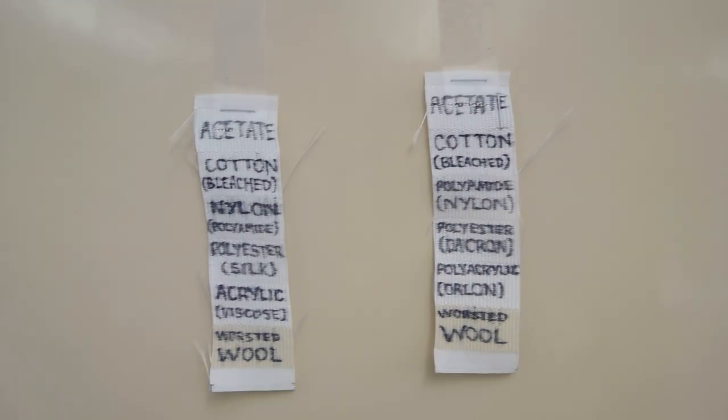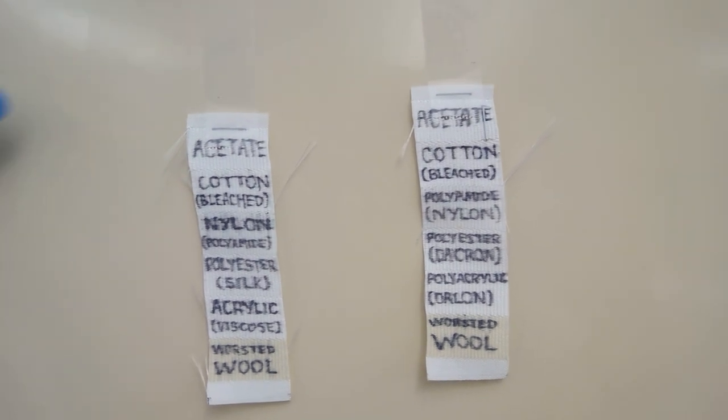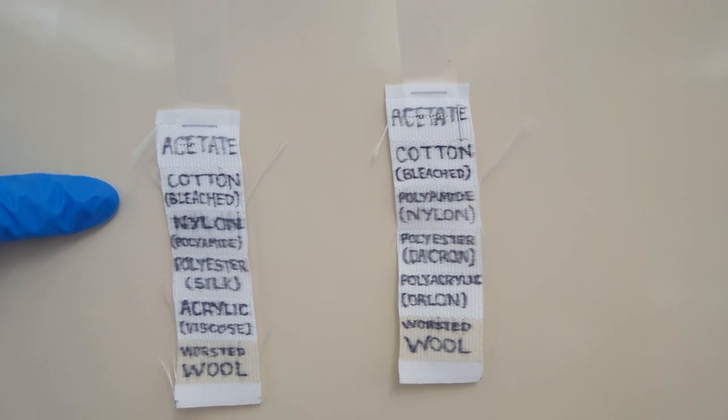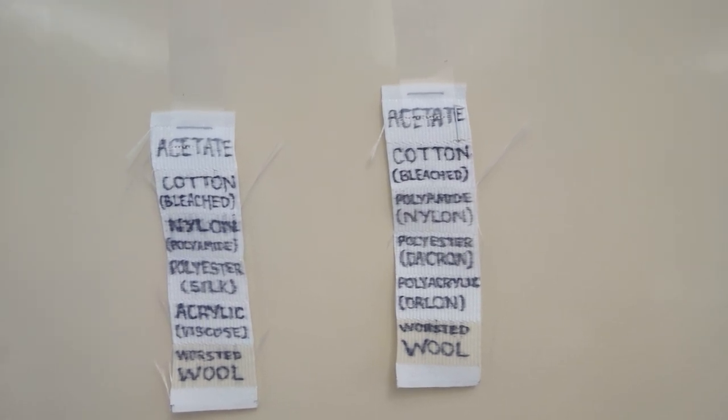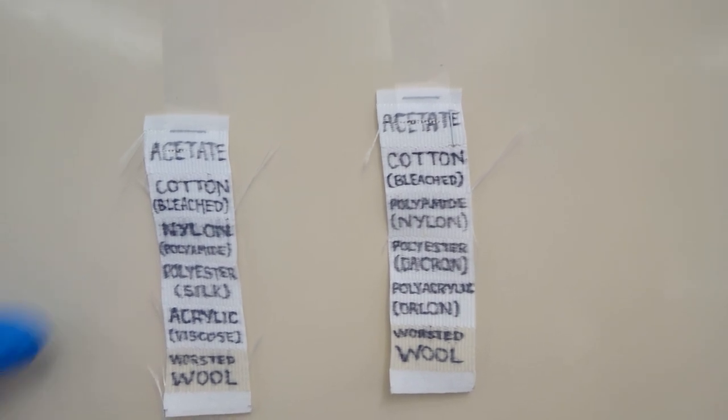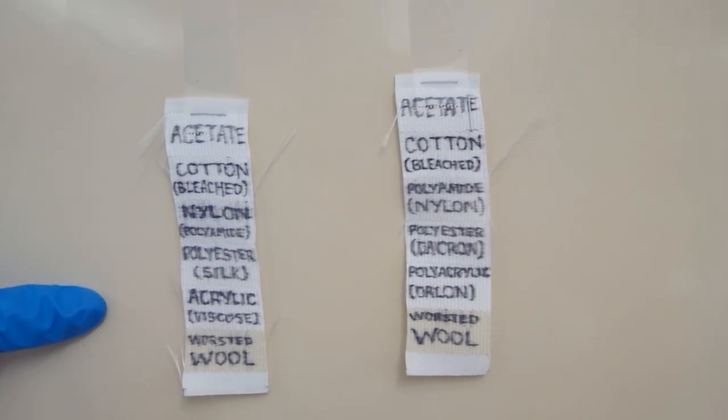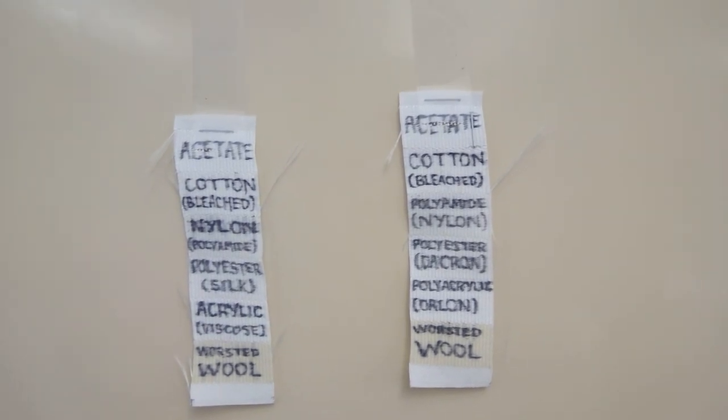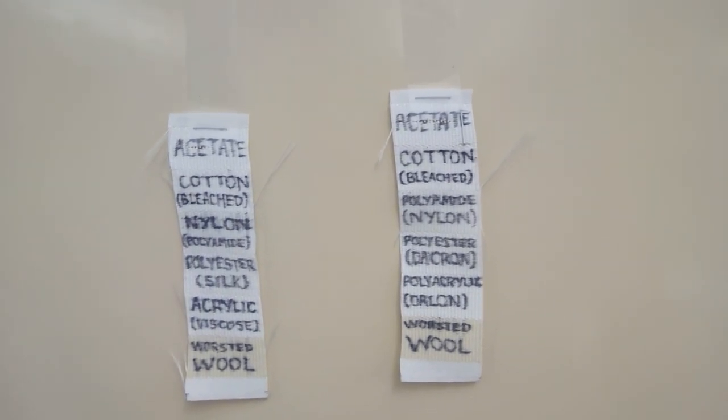On this multi-fiber fabric strip we have acetate, which is a synthetic fiber. We've got cotton, which is a naturally occurring fiber. Nylon is synthetic, as well as polyester. Acrylic is another synthetic fiber, and then we have worsted wool, which is a treated type of natural wool.